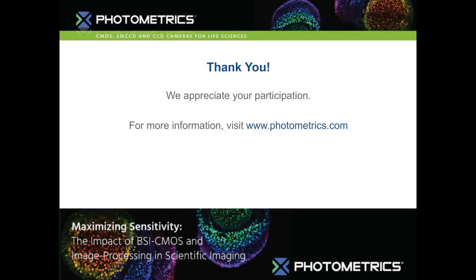Yes, so is it limited to microscopy? Definitely not. It really becomes what is required for your application and what the necessary performance requirements are. And so can you use it for surveillance and autonomous cars and long distance? Yes. The challenge will become, if you take long distance imaging or telescopes, for example, they typically use much longer exposure times, and CMOS technology isn't really conducive to that. But if you need high-speed acquisition with that maximum sensitivity, for any of these applications, it becomes a viable solution.